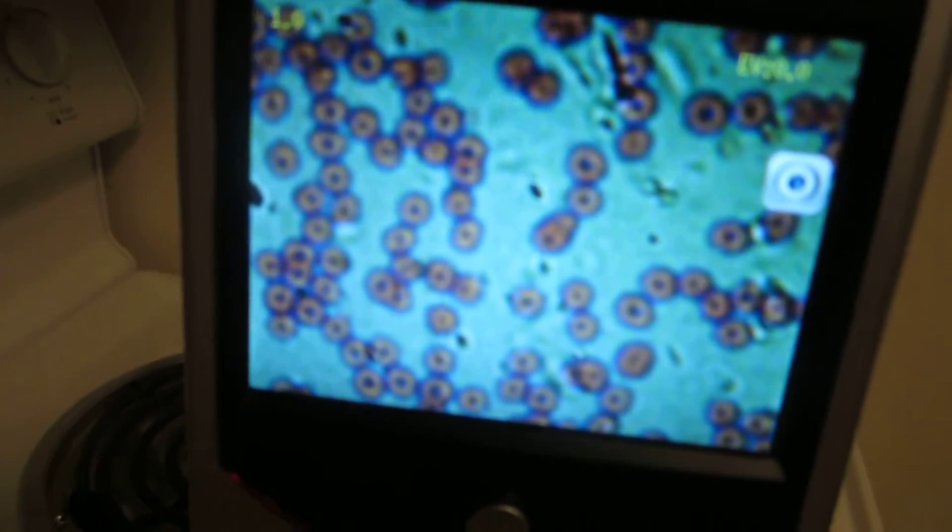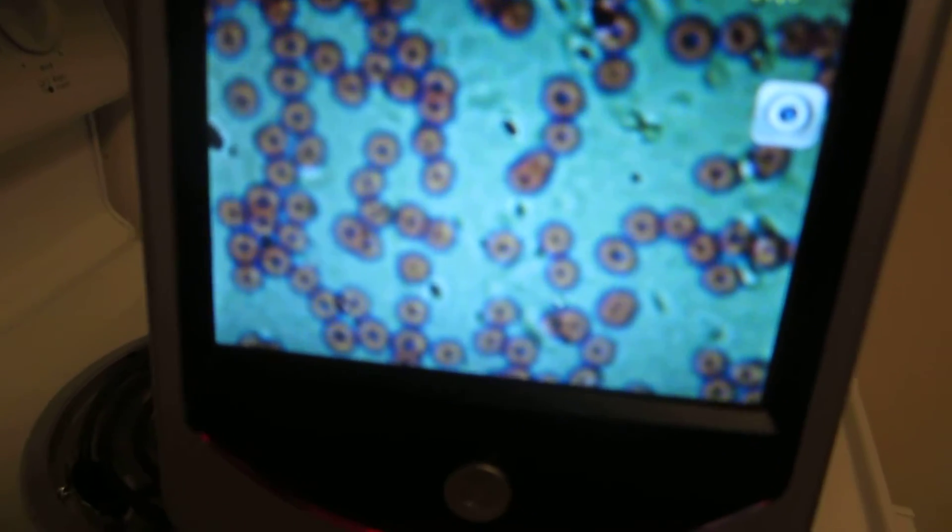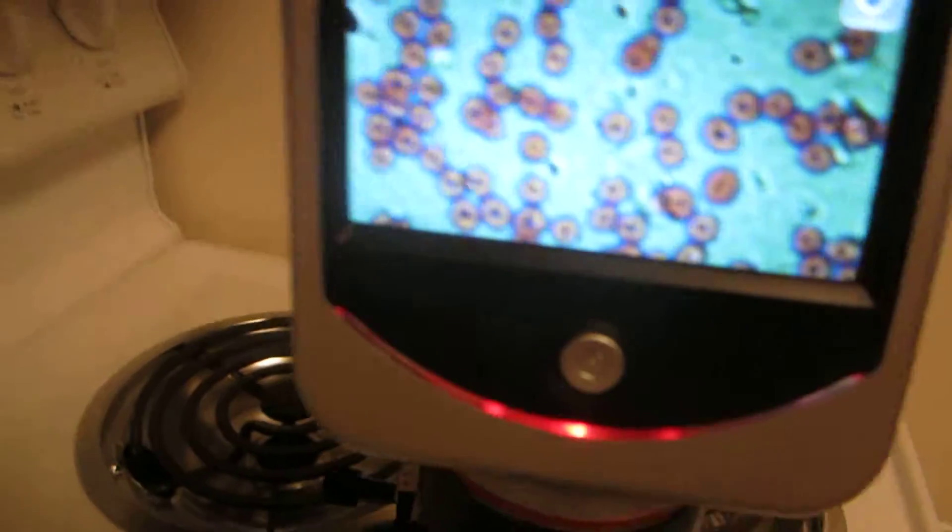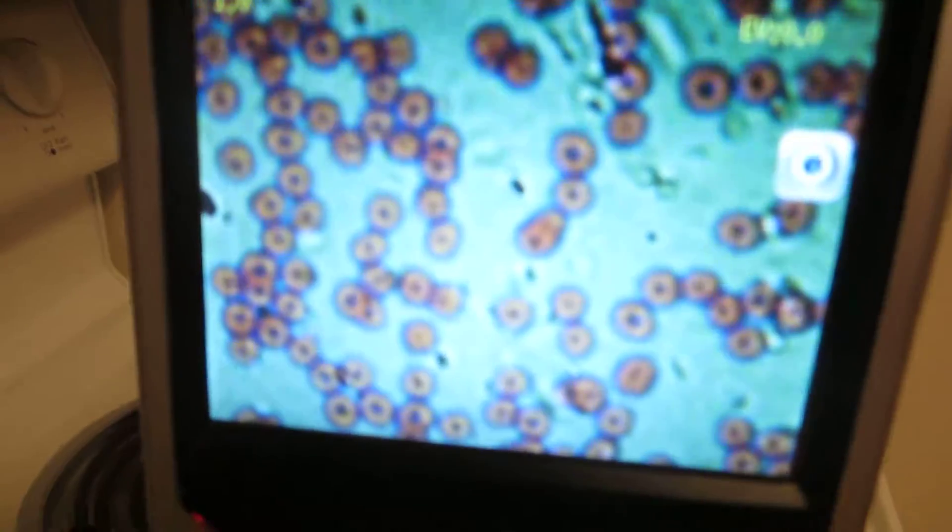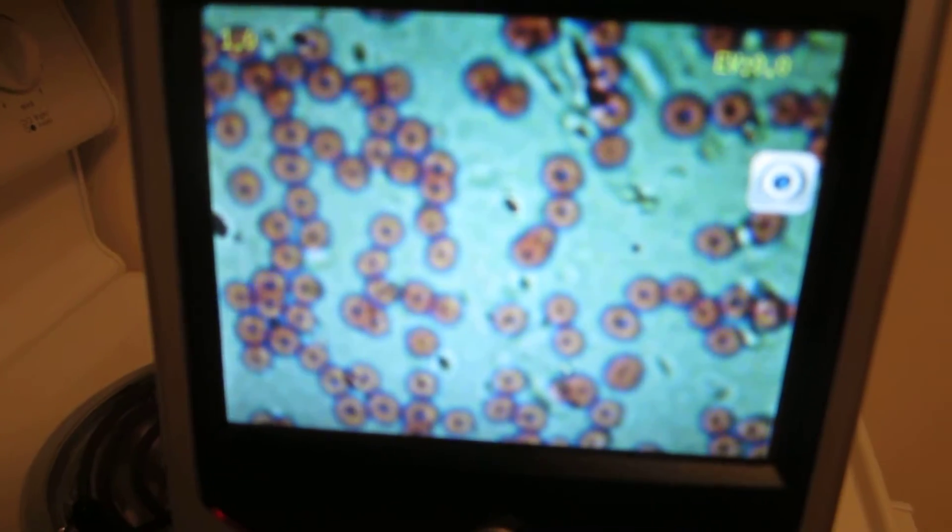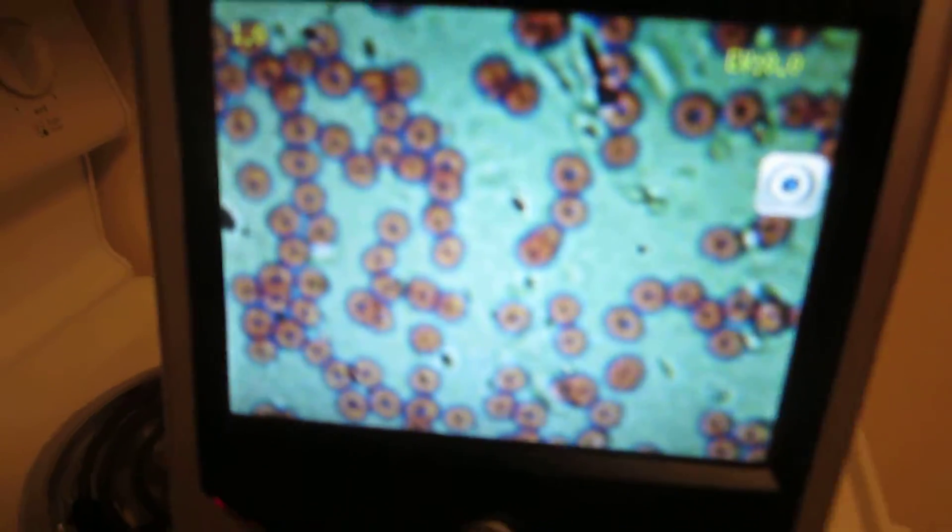And lo and behold, here we have the donut-shaped human blood cells. You can see them there, very neat.